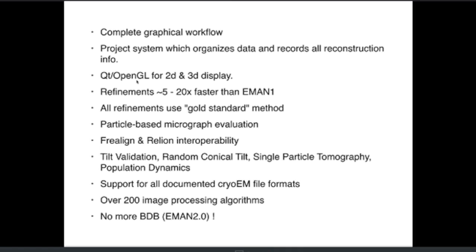So in most cases, when you're working on a cluster, you're not going to be remotely running the graphical interface from the cluster. And I'll describe how we typically work with the clusters for doing our refinements and integrate that with your local desktop machine a little bit later in the demonstration and the presentation.